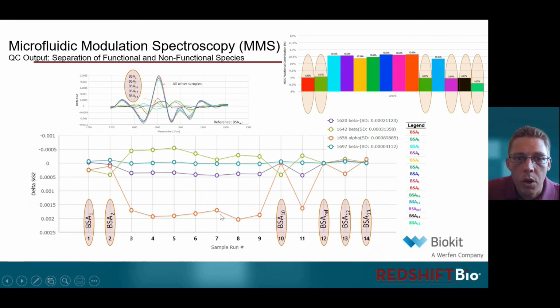The ones, if you look particularly at the orange line, that follow the baseline very closely, the same group I showed you before, and the second group that shows a structural deviation from the reference that was known to function. And indeed, the group that shows the highest structural similarity to the reference, the ones highlighted down the bottom here, were indeed shown to be functional in this ELISA assay, whereas the second group that shows this approximately 1% change or difference in structure to this known functional reference were shown to be inactive or incorrectly active in this ELISA assay.